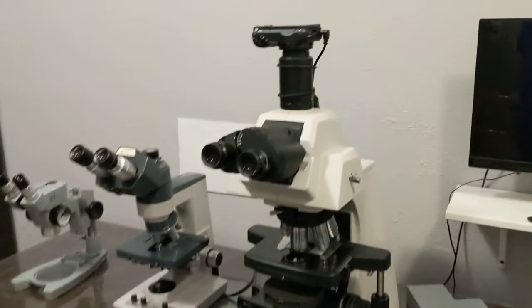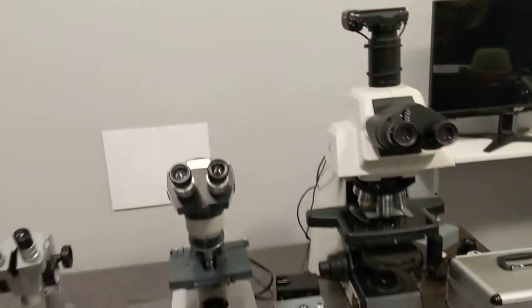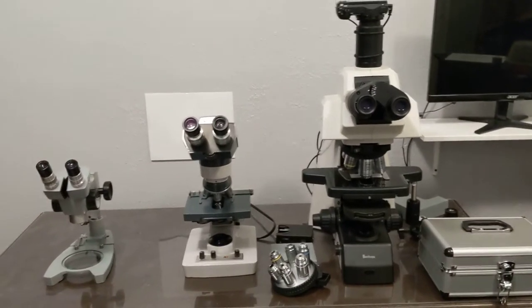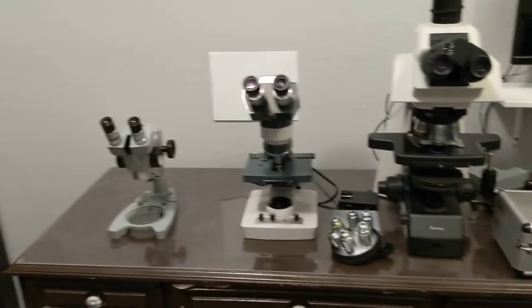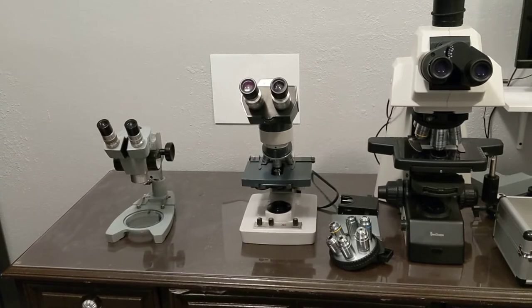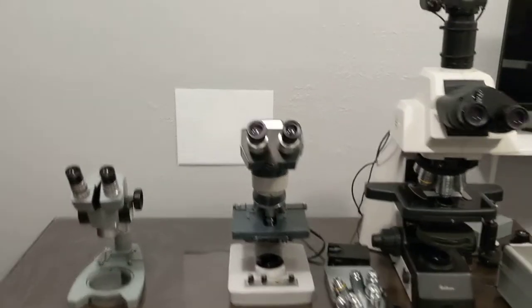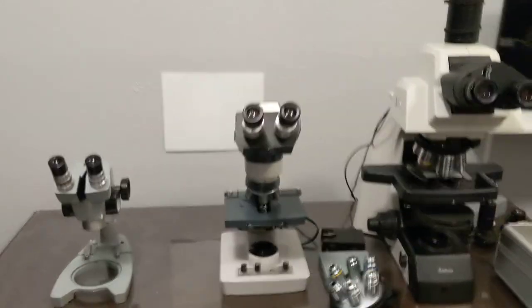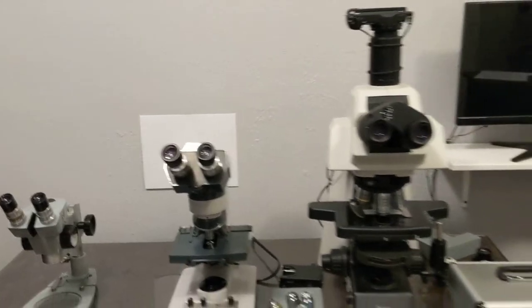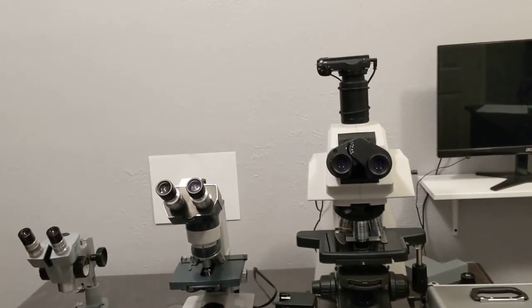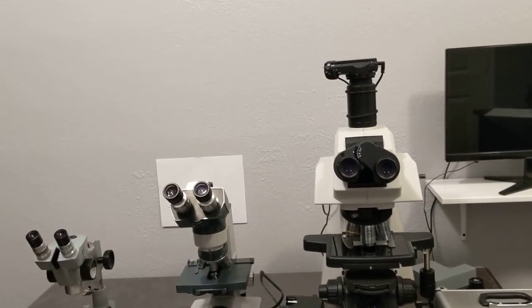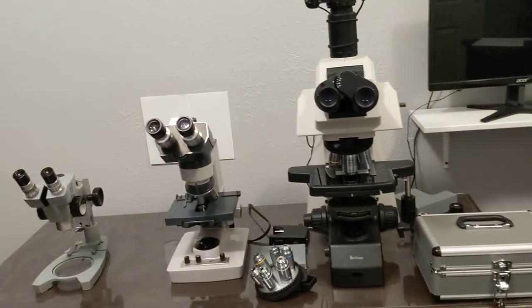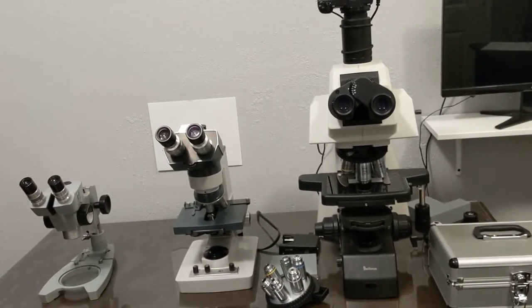I bought a lot of really expensive things that I wouldn't have bought otherwise if I was buying from, let's say, Nikon. Even looking at used stuff, I wouldn't be able to get this type of system for the same price.